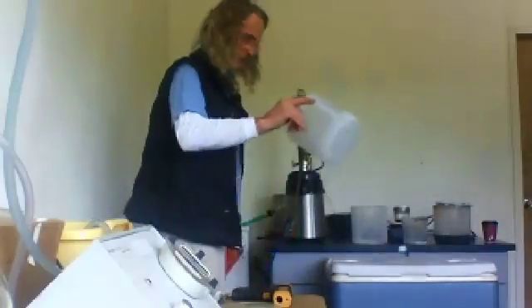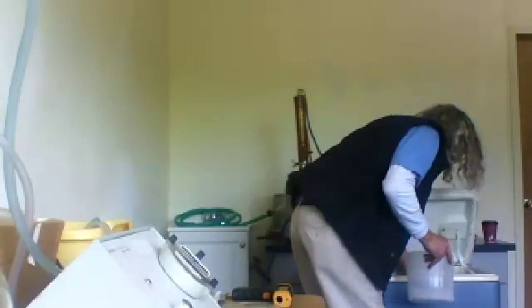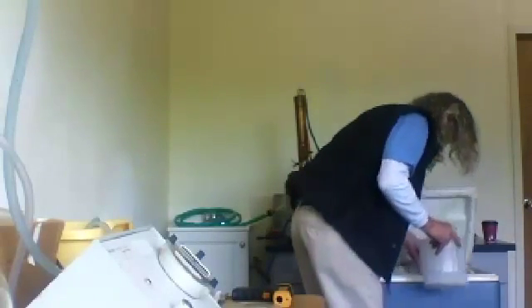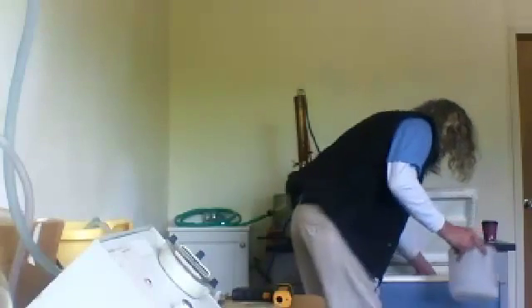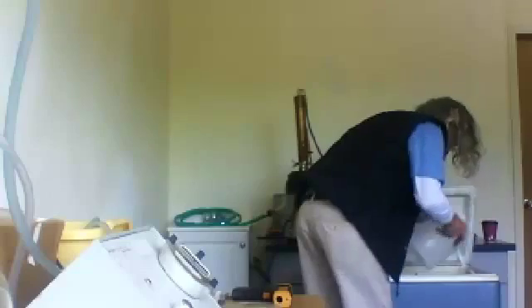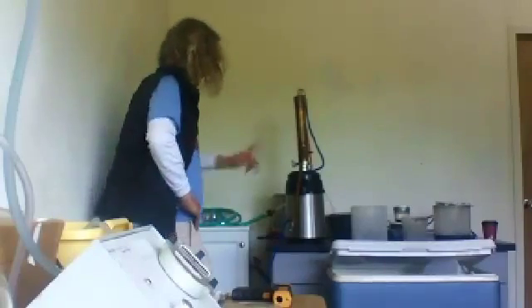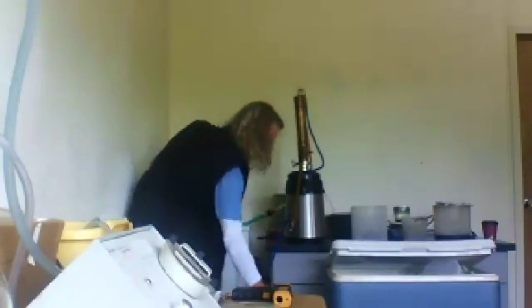Oh, yes. Okay, now what we're going to do, guys, we've got a little bit of alcohol left out here that's unfrozen. So I'm going to put that back. Okay. There you go. The winterization is just about done. Okay. Nice and crystal. Okay, this is off. We've recaptured our alcohol.